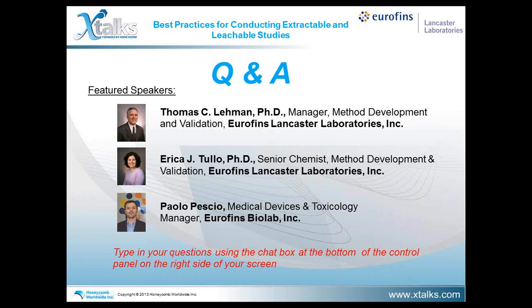In terms of evaluation of data that the manufacturer provides you, that's a really good question. One point I want to make, and I did make it during the webinar, is that you're never sure what you're going to get from a manufacturer's viewpoint because there's no standard approach in industry. We've seen examples of manufacturer packages that are very detailed and thoroughly performed, and in other cases they may only do very general testing, such as TOC or NVR testing, which may give you an idea of total extractables, but it does not give you any idea in terms of risk assessment for individual extractables nor their ID. So one has to look at the package in detail and determine what was the intent of your study, and whether what was provided to you by the manufacturer covers the intent of your study.